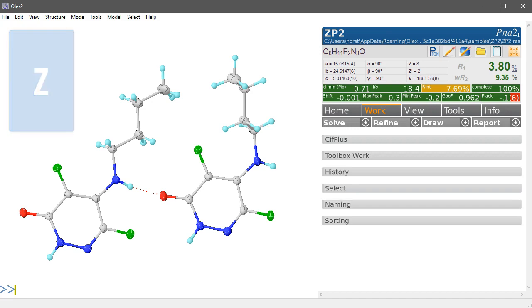Let's take a look at Z and Z prime. Here's a structure called the ZP2, Z prime 2. So there are two independent molecules in the asymmetric unit. And the formula of this molecule has something to do with 2-fluorines. So this is the formula we want to be displayed up here.